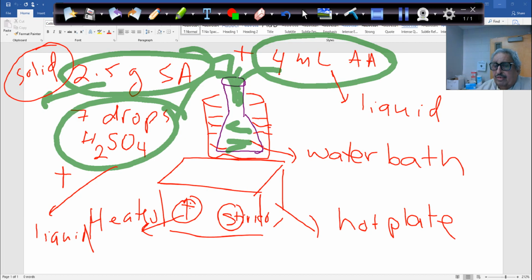So now we have these crystals. We have to filter it. But before we use the vacuum filtration, you have to have filter paper. Filter papers are here. You have to weigh it, and before weighing it, write the name of your group. Suppose two people are working, write the names of the two people. If three people are working, write the three names.